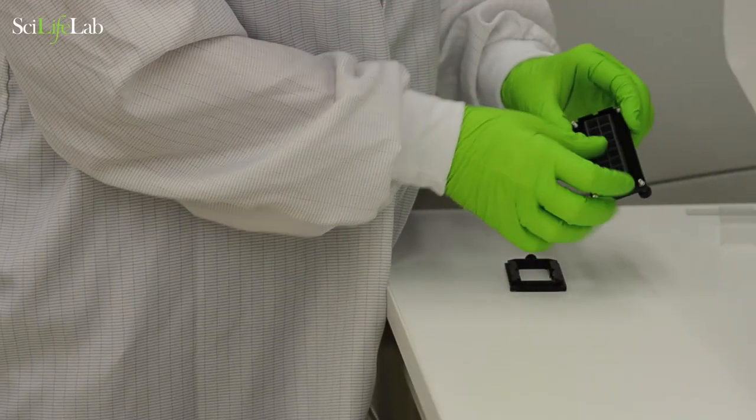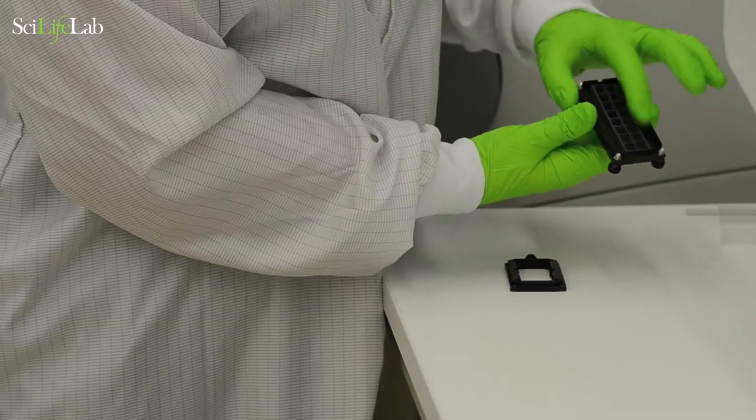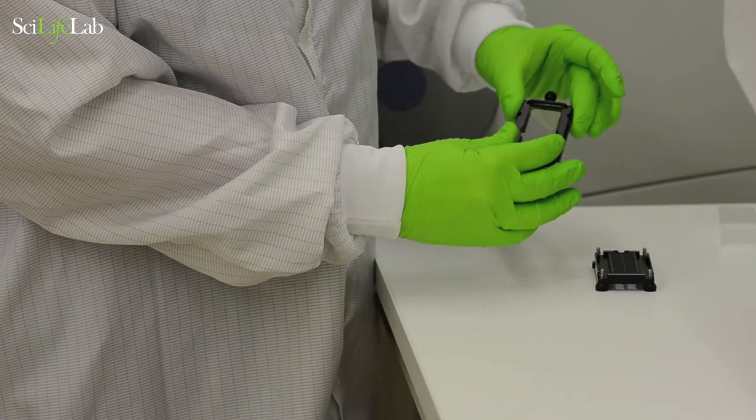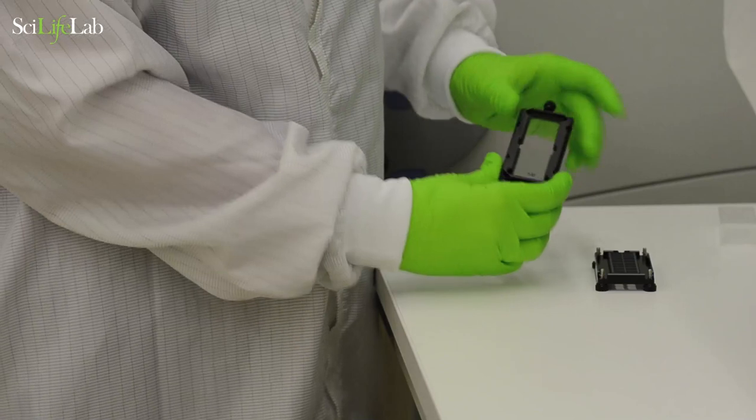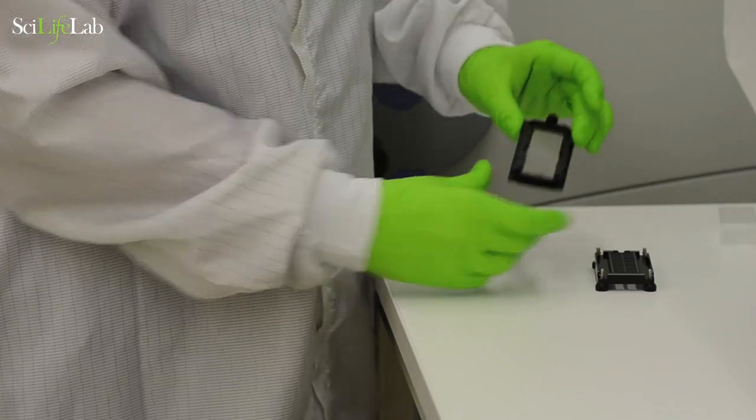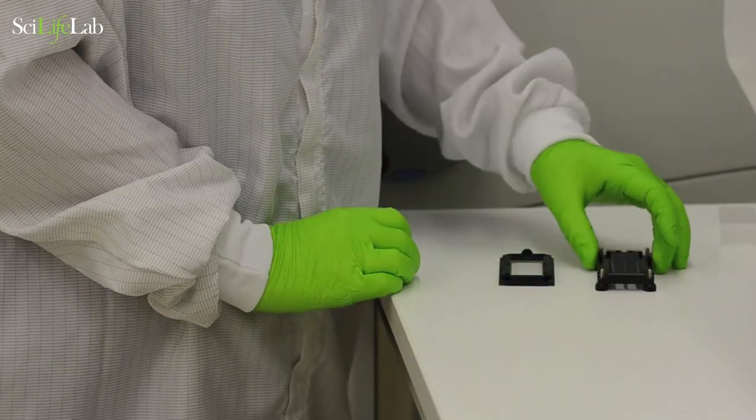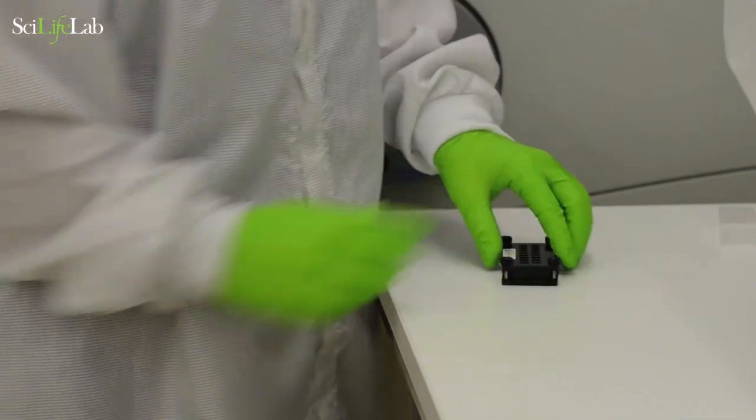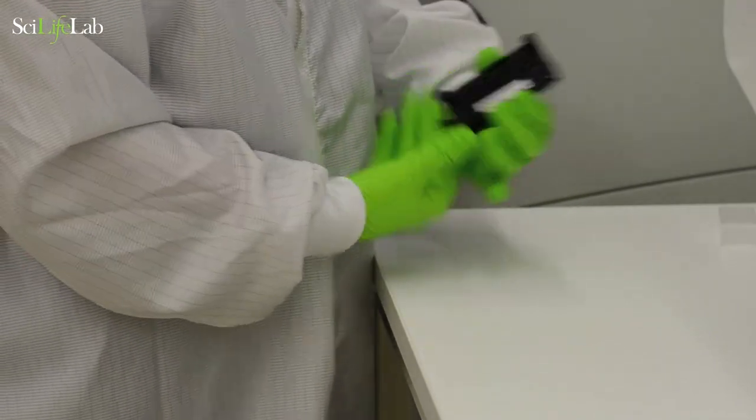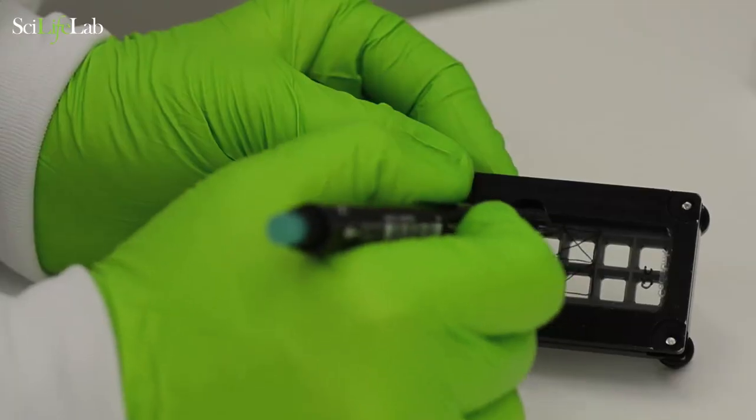Assemble the microarray cassette and attach the glass slide. Mark the back side of the glass to show where to attach the tissue sections.